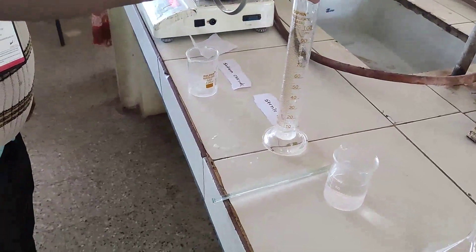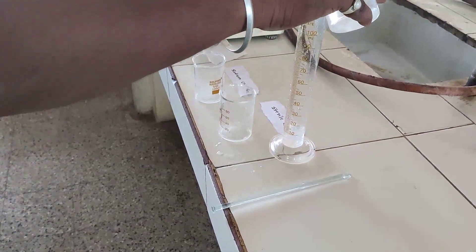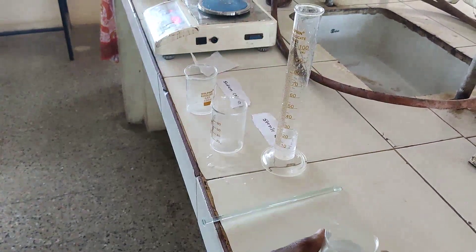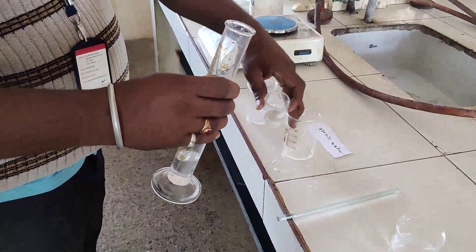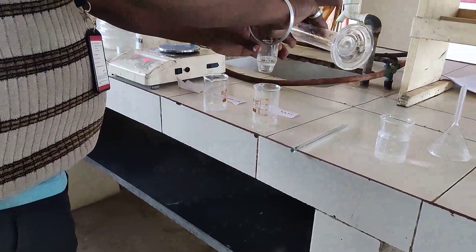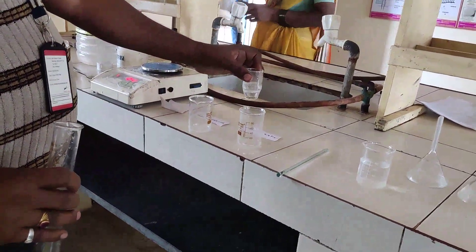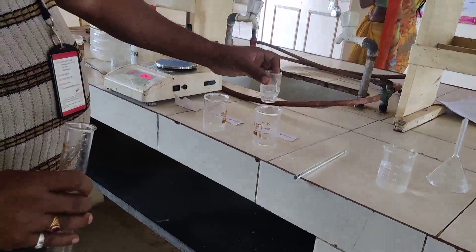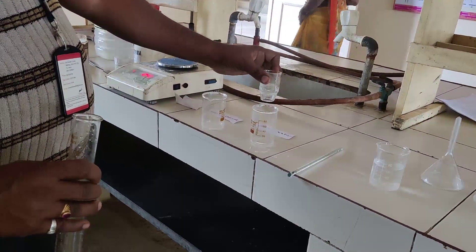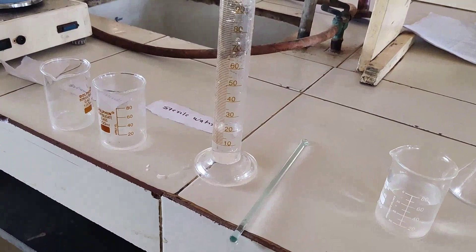Make up the volume up to 20 ml, because you have to fill two ampules each containing 10 ml of sodium chloride solution. After that, filter this solution with the help of a sintered glass filter — normally a vacuum pump is used for this. After filtration, the volume is 20 ml. Transfer the solution into a sterile beaker.